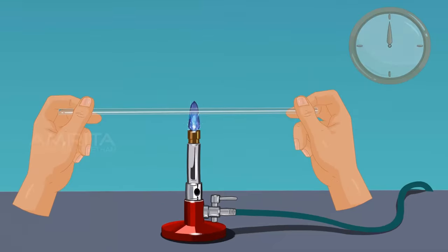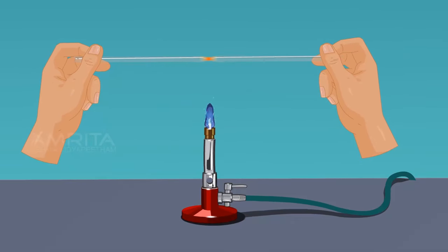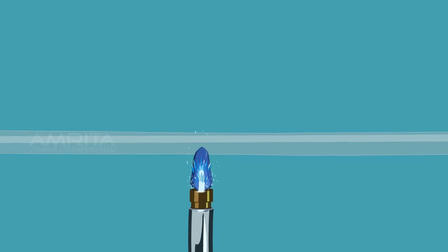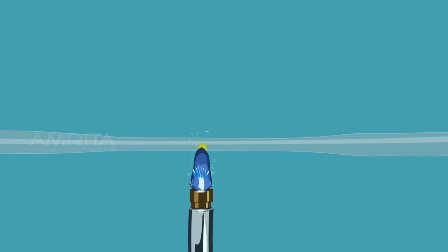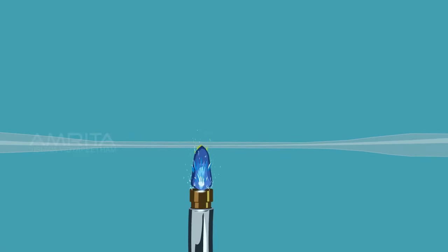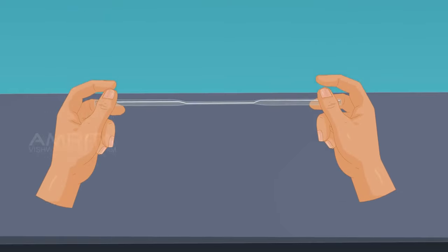Keep rotating the tube till it softens. Take the tubing out of the flame and gently pull the two ends in the opposite directions. The middle portion is drawn out to a thickness of about two millimeters. Allow the tubing to cool.